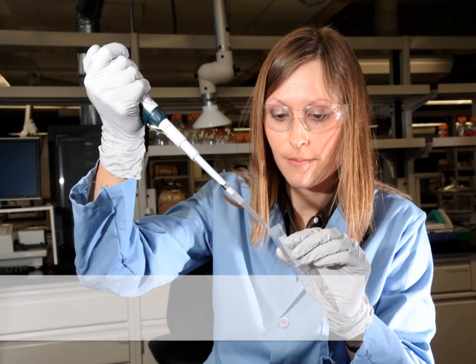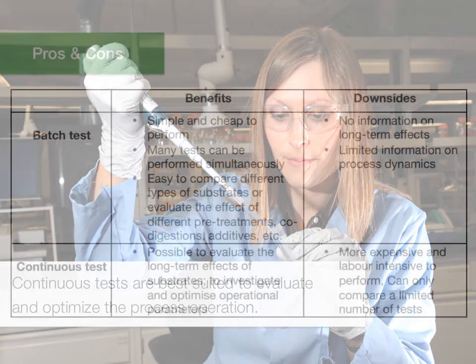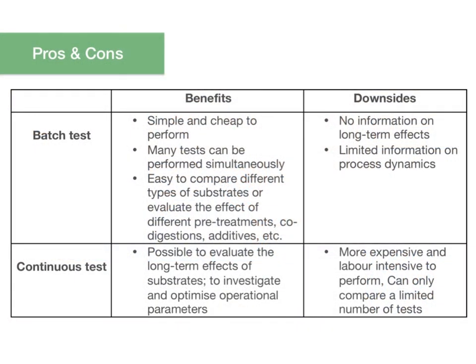Continuous fermentation tests are most suitable to evaluate and optimize the way a process operates and to study the long-term effects of substrates. To summarize what we've learned, let's look at this table of pros and cons for both tests.